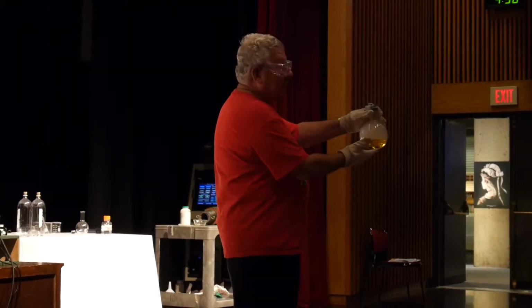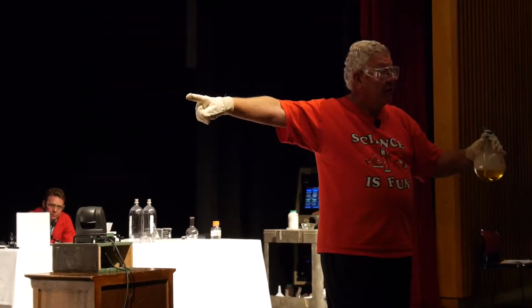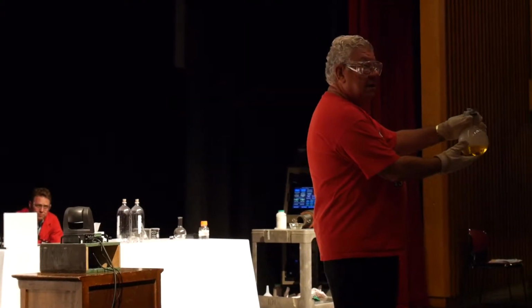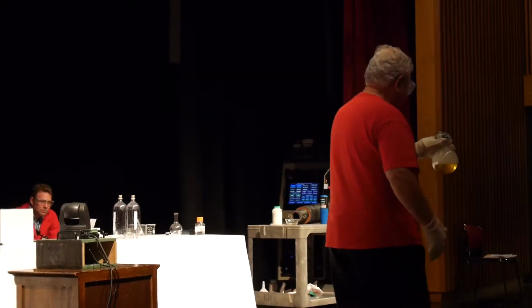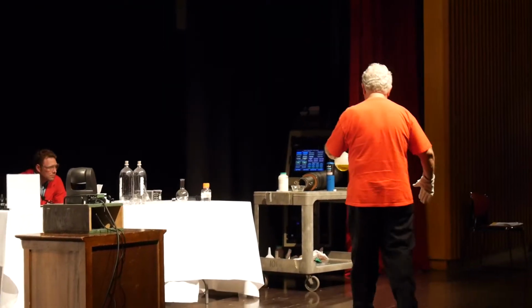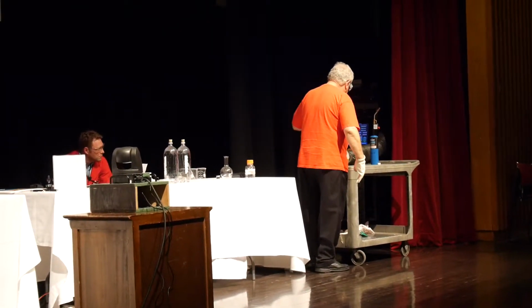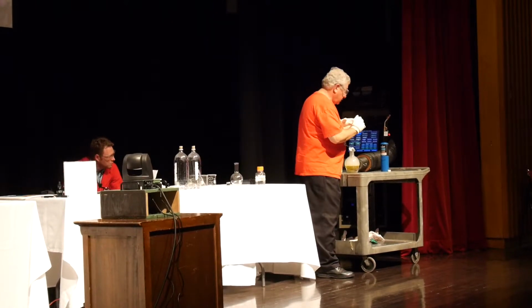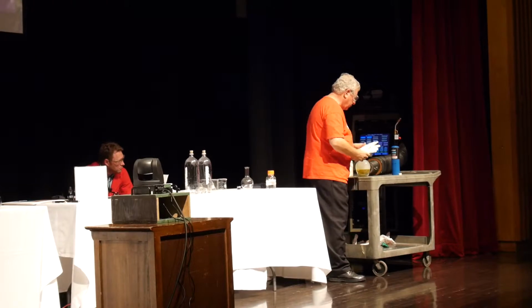And then what I had down here is the very same indicator at the very far end there, bromethymol blue, and the solution became acidic. So sulfur dioxide with water gives us acid rain. And maybe you can smell a little bit of the sulfur here. That's why we're doing the experiment right next to this very powerful suction, so we don't want the sulfur dioxide to be in the room.